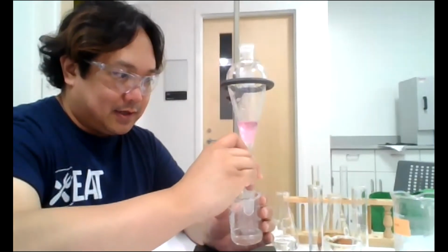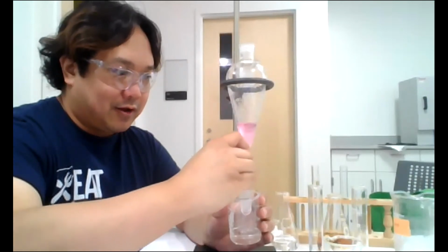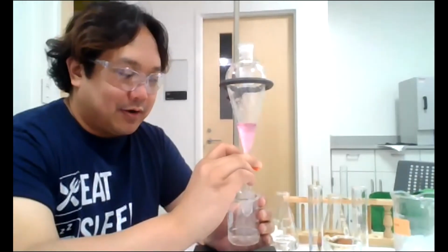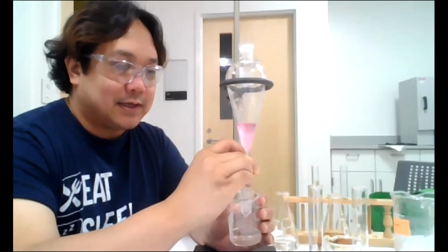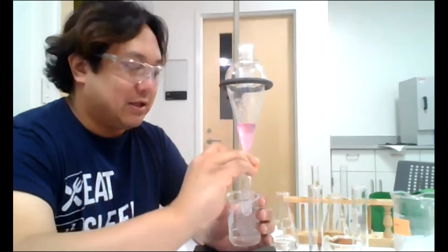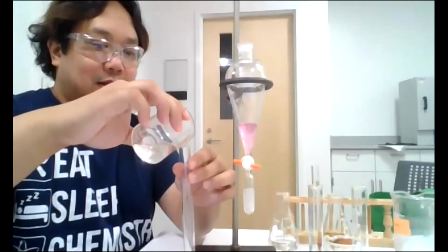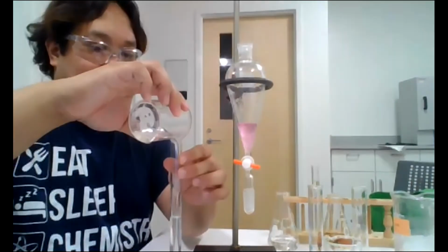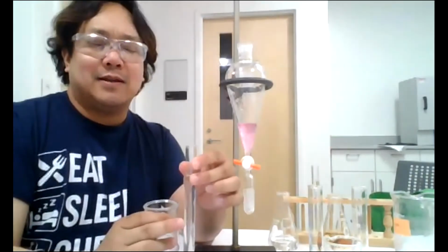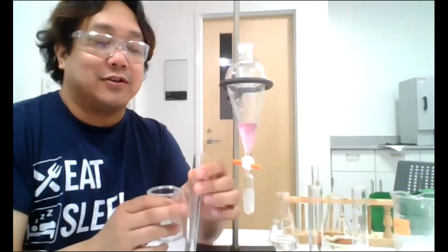Still see some of the more dense bottom layer, but again, I don't want any of the top layer to get into my beaker because this is the last drain before I analyze. And here's my test tube. And again, this is also the trick: you've got to know which layer is which layer.